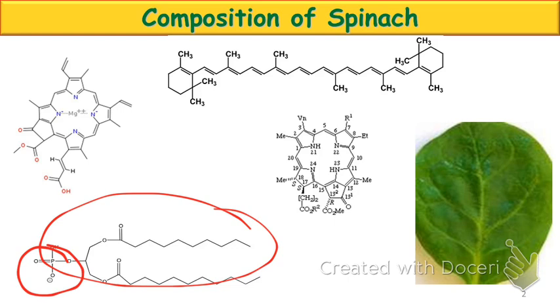But wait, you all say. There's also... But wait, there we go, I heard it. There's also... If we go up and look at that top one, what did I just circle in now? More charge. Why is that charge not as polar as the bottom charge? Where's that charge located? It's located surrounded by a whole bunch of nonpolar things. Okay? Whereas in the case down below, we've got that same charge, but it's now accessible. Okay? It's floating out in the middle of the solution. Okay? So what we can do is now try and take advantage of these intermolecular forces and try and bulk separate them away from each other.